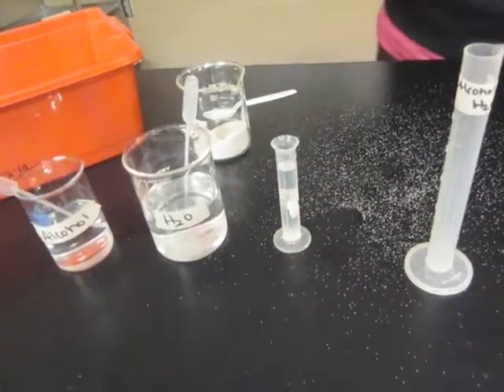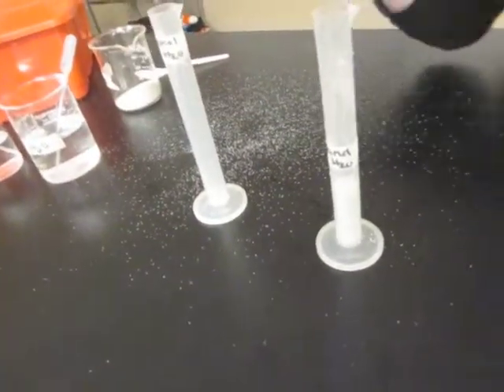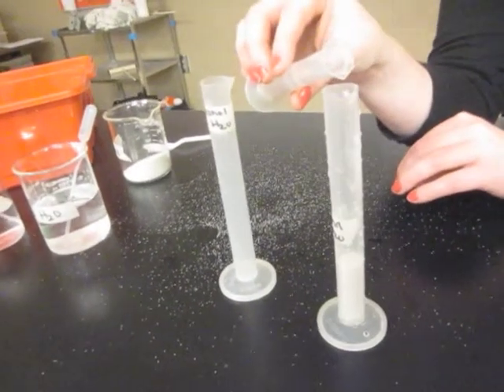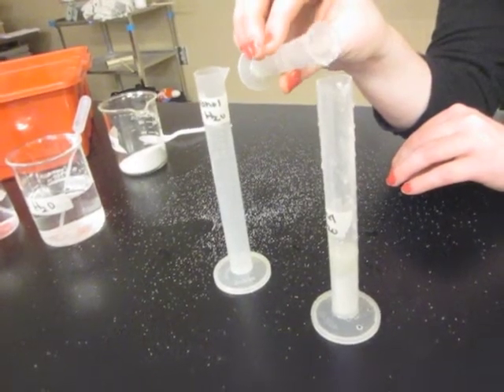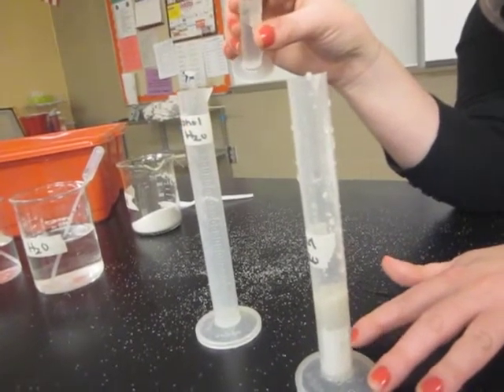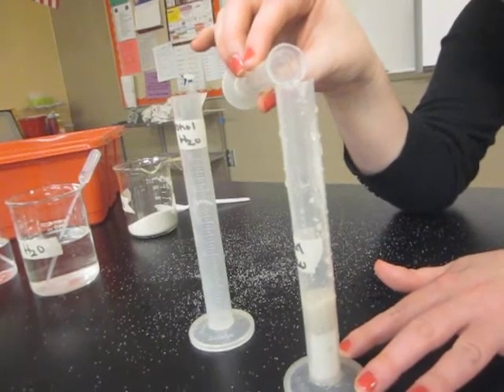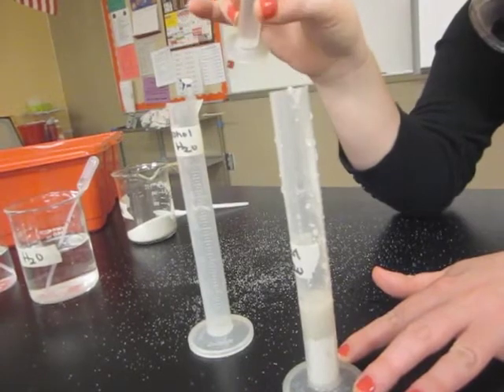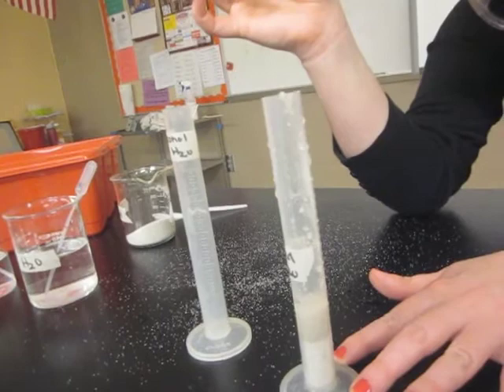Alright, the next thing that you want to do is pour water into your graduated cylinder with the sand, but you want to pour very slowly. Now you only want the water level to fill until the 10 milliliter mark. So you want to pour very slowly, give it some time to run down. Once it moves down a little bit, you can pour a little bit more. Give it some time to move down.